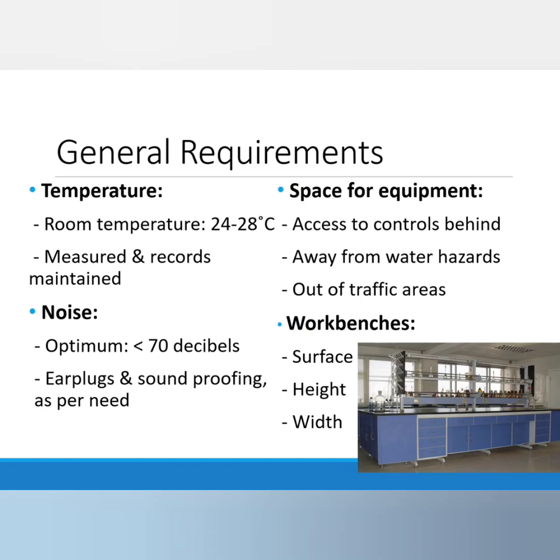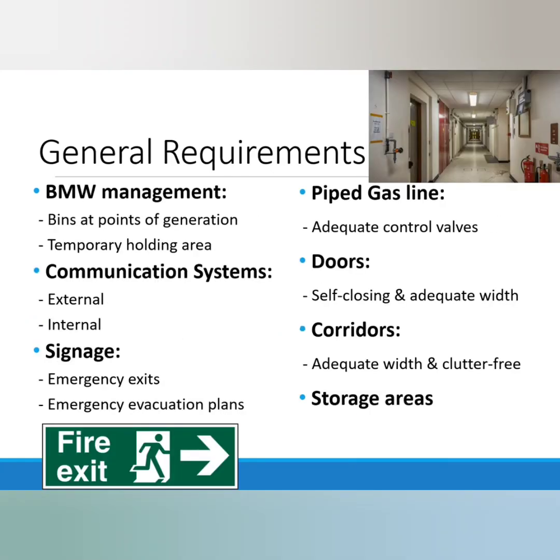The workbenches in a laboratory must be made of impervious material with a smooth surface. They should be of convenient height and width in accordance with the work done on that workbench. Biomedical waste management. Adequate colored bins as per the latest biomedical waste management rules must be provided at all points of waste generation in a laboratory. There must be a robust communication system, usually with phones, for internal and external communication. Emergency exit signages and emergency evacuation plan must be displayed for all the laboratory personnel.